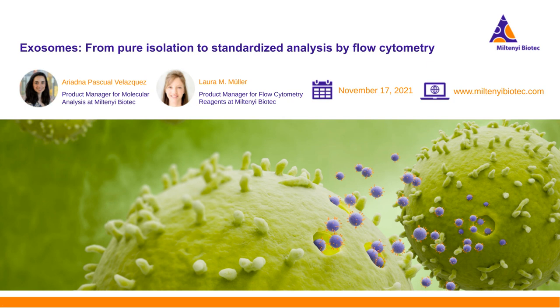Thank you so much. Now, when using flow cytometry to analyze EVs, is it known that the equipment must be properly rinsed before use? And what cleaning protocol do you use in your flow cytometers?